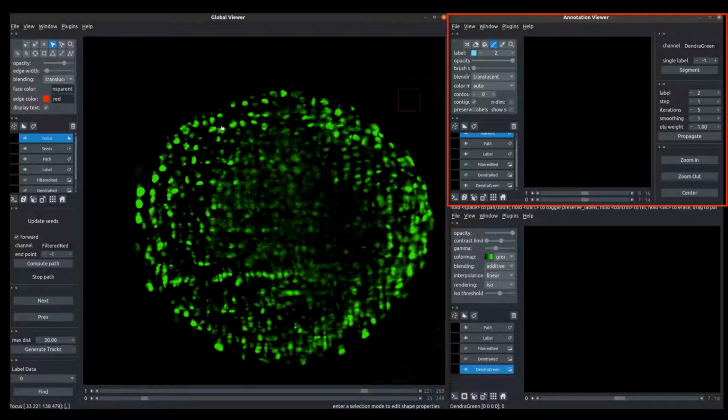This subset of pixels is used to label the remaining ones, resulting in a segmentation which we can propagate across different time points. So from a single annotation, we are able to obtain segments across different frames.